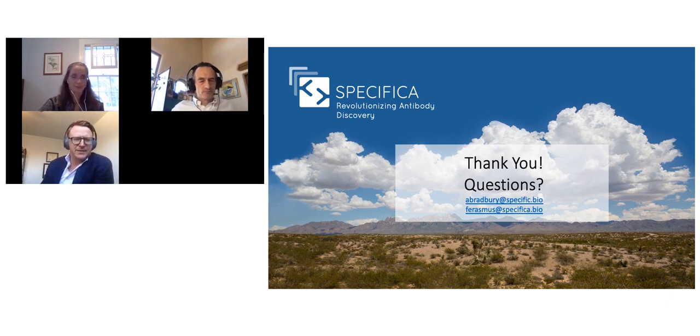And then NGS. Again, for MiSeq, you can get up to 10 million reads. It's about 24 million paired-end reads, and that condenses down for single sequences to about 12 million or so, and then that condenses down further when you filter for quality. PacBio is around 2 million reads in total for Sequel 2, but again, this drops down as you filter out the low-quality scores and retain the high subset as we do, into about the upper hundreds of thousands to low millions.